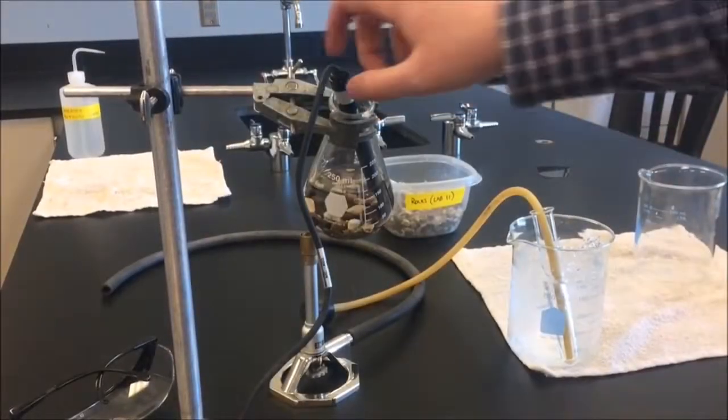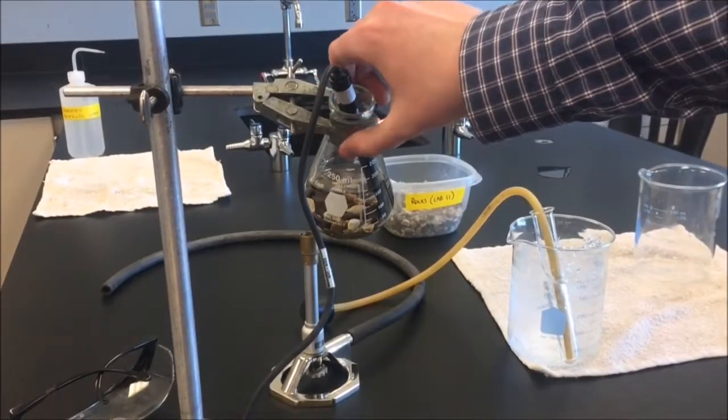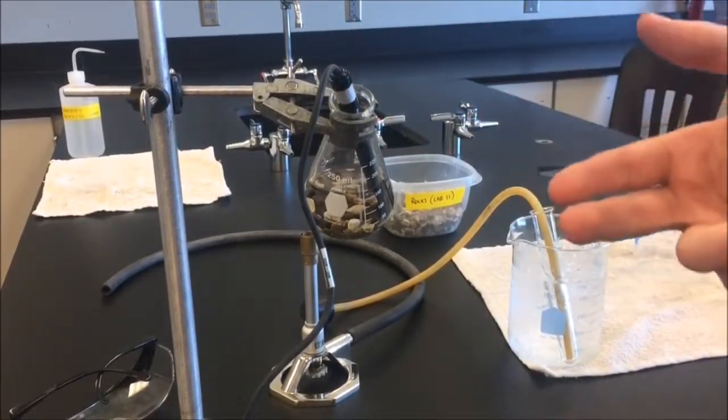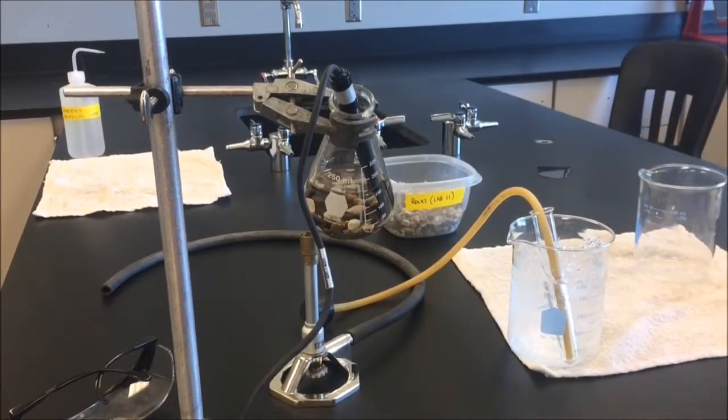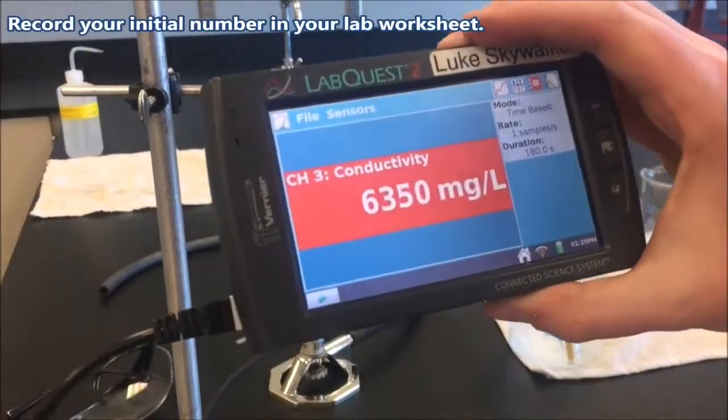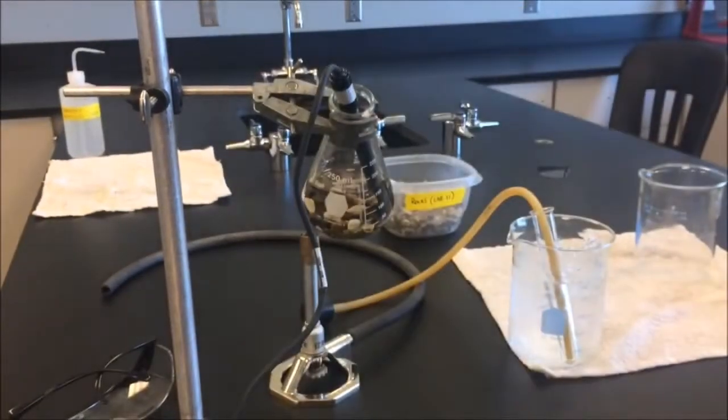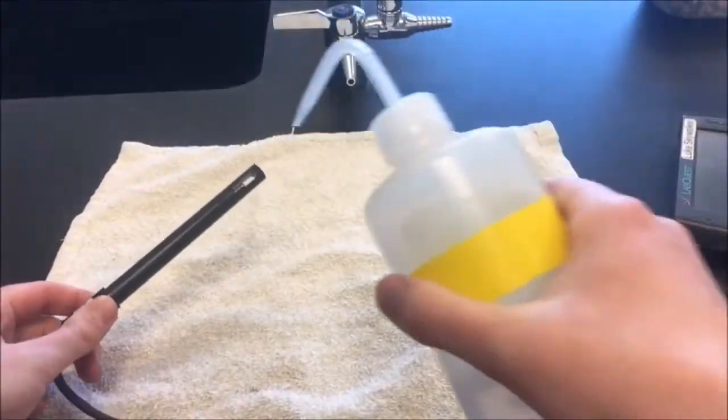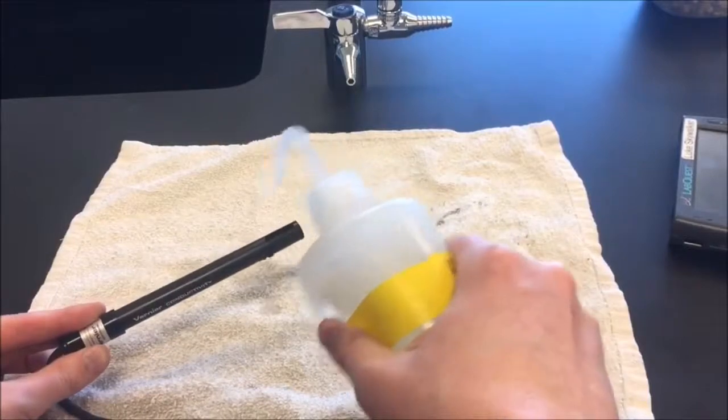So place the conductivity probe into your Erlenmeyer flask. I had to tilt it a little bit so that I could get my entire sensor under the water. So if you need to do that, do that. You should be getting a number on your probe somewhere in the 6,000 to 8,000 range. And again, let's spray off our conductivity probe with some distilled water.